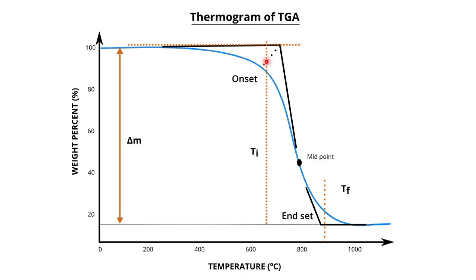And this is the onset of the degradation or weight loss. This is the midpoint, and here it is the end set of the weight loss.